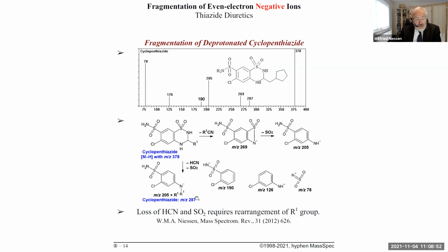And the way I wrote it is that it is going to the nitrogen, but very recently I saw some data suggesting that it might also go to this position. So again, we have an example of skeletal rearrangement.